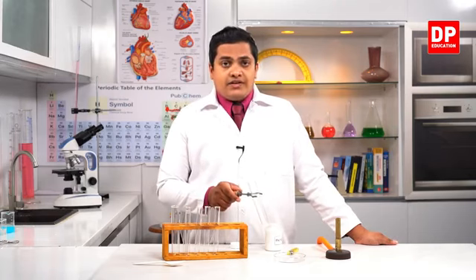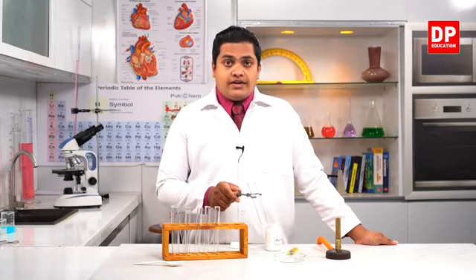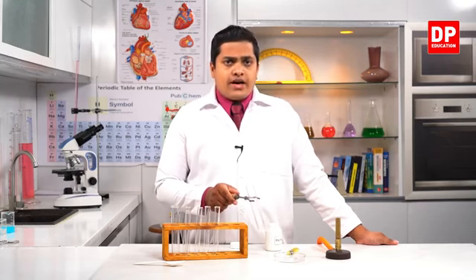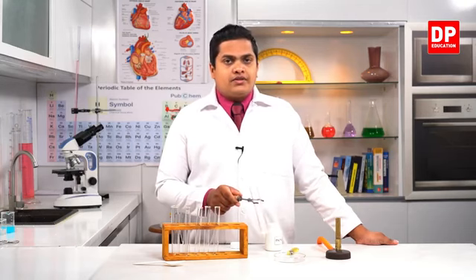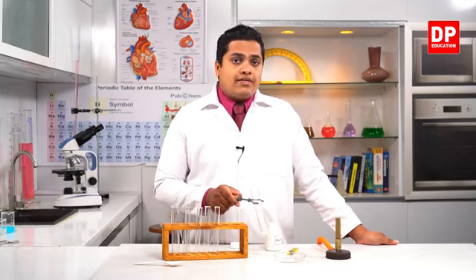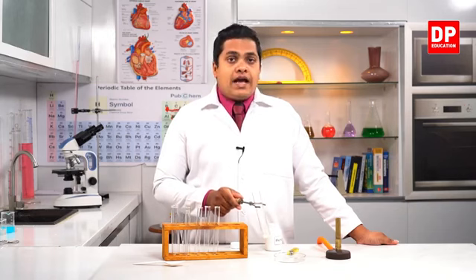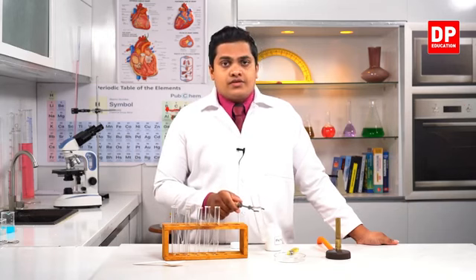So in this activity, it's obvious to us that lead nitrate has undergone a chemical change to produce a gas. Right, now let's continue with another experiment to observe what other evidence we can find to say that in a given system a chemical change has occurred.